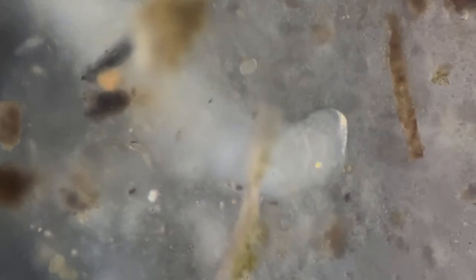See that peristaltic movement in the body? The alimentary canal is undergoing peristaltic movement by which it propels the food further down the canal and the digestive arrangements. This is the head region.